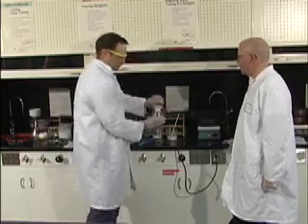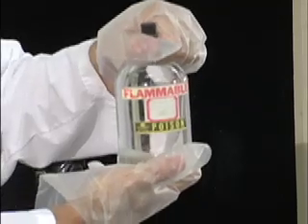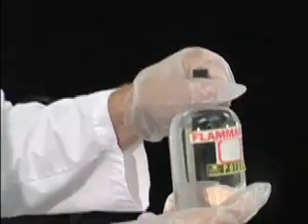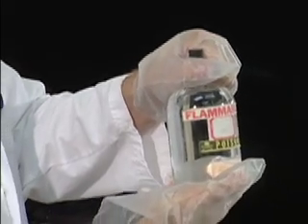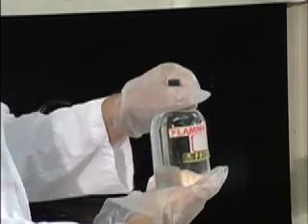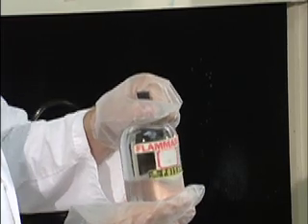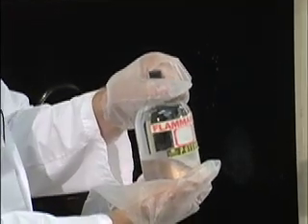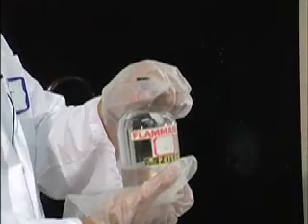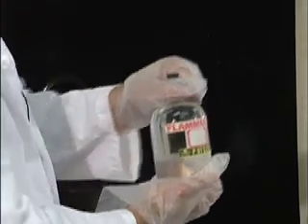You'll notice there's two big signs on the ethanol portion here. We're not in 1960 anymore where we can drink the ethanol. Not that we ever did. Not that you ever did. This ethanol is both flammable and poisonous. Denatured means that you've added something like a little bit of phenol or a little bit of benzene, I believe. So it's not straight ethanol. This is only about 95%. So you don't want to be drinking this stuff.